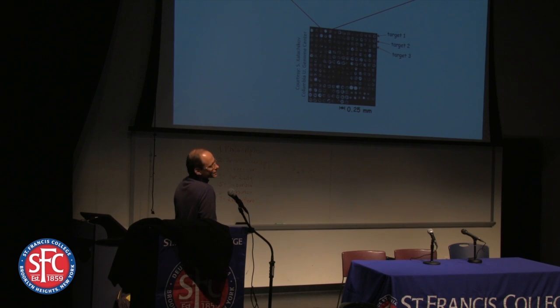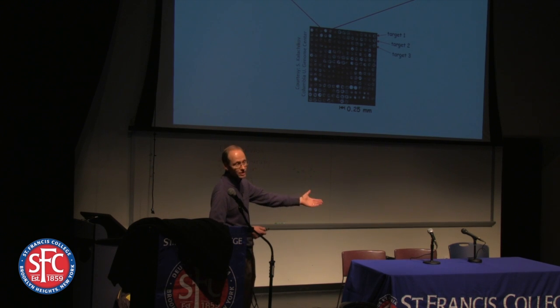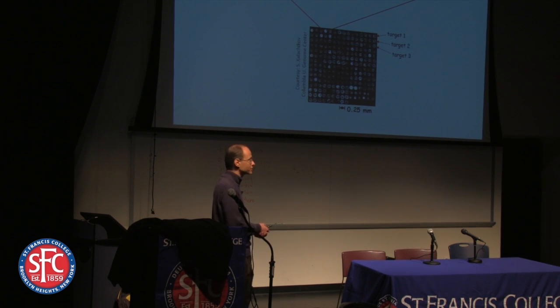All right, so some other things to mention about biosensors. Why do reactions on the surface? They're complicated, right? I put a biomolecule on a surface. The surface might perturb the biomolecule. I'm going to get non-specific adsorption of the analyte. Why am I bothering with this on a surface? The big advantage of surfaces is that you can really multiplex things. You may also need it, like if you go to electrochemical detection, you actually have to do it on the surface of the electrode. So there may be other reasons to do it.